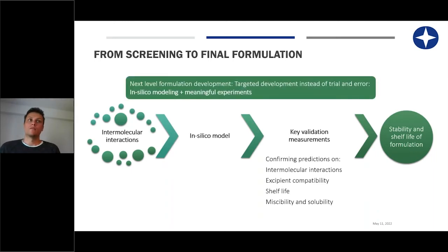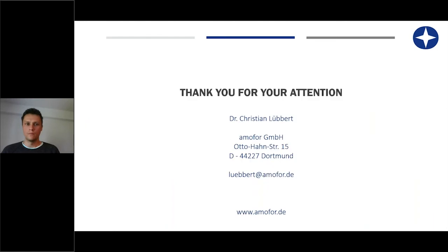This is what I understand with next level formulation development, that we are doing really targeted experiments with the DVS. We combine that with the calculations with meaningful experiments, and by that get a really good understanding of the ASD and what will happen, so that we can in the end sleep well and do not have to be afraid of crystallization anymore in the ASDs.